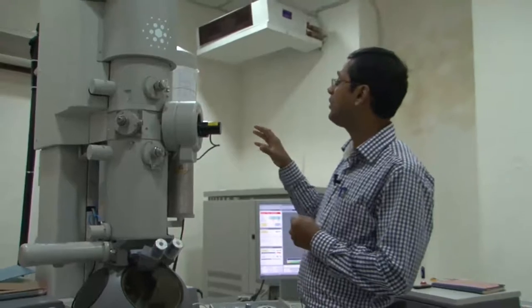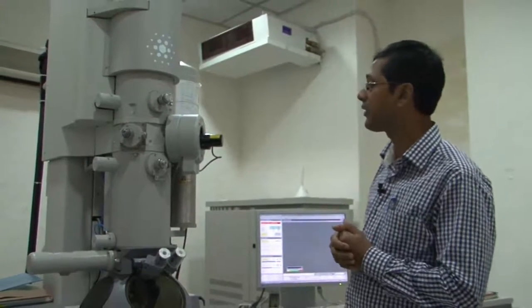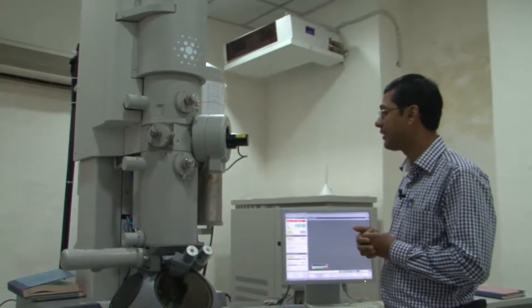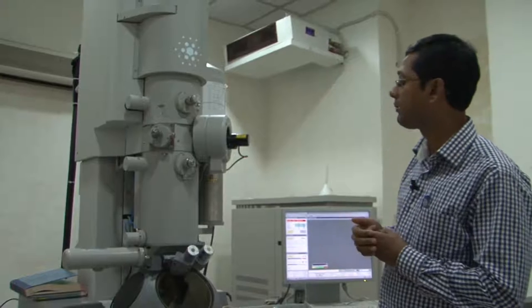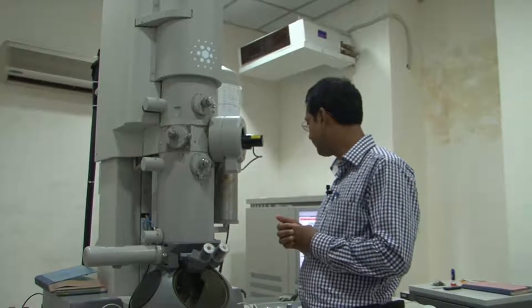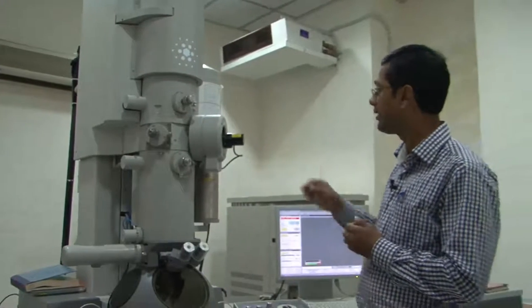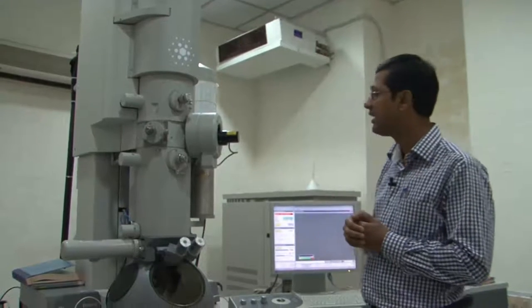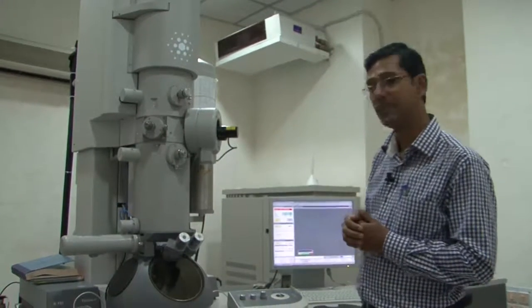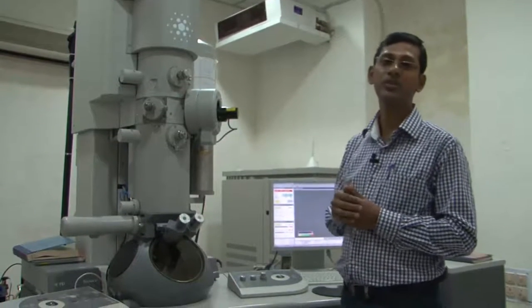So therefore, depending on our use, we can attach different kinds of things to the microscope. One can even attach other things, like people sometimes use what's called cold stage microscopy, where the holder itself is a cold stage, and this kind of stage is actually used for biological sample viewing. So depending on the use or depending on the need, a transmission electron microscope can be used for any purpose.